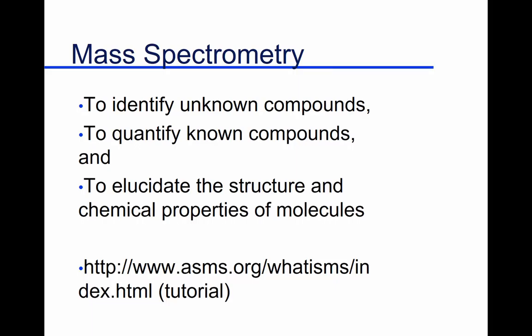As I maybe mentioned, maybe that was a different lecture, I had a student that worked over a year collecting materials for NMR to get enough material to actually analyze a compound by NMR. And so you really don't want to spend a year trying to isolate enough of something to identify it. And so that's, again, where mass spectrometry shines. Really good sensitivity, really good amount of information.